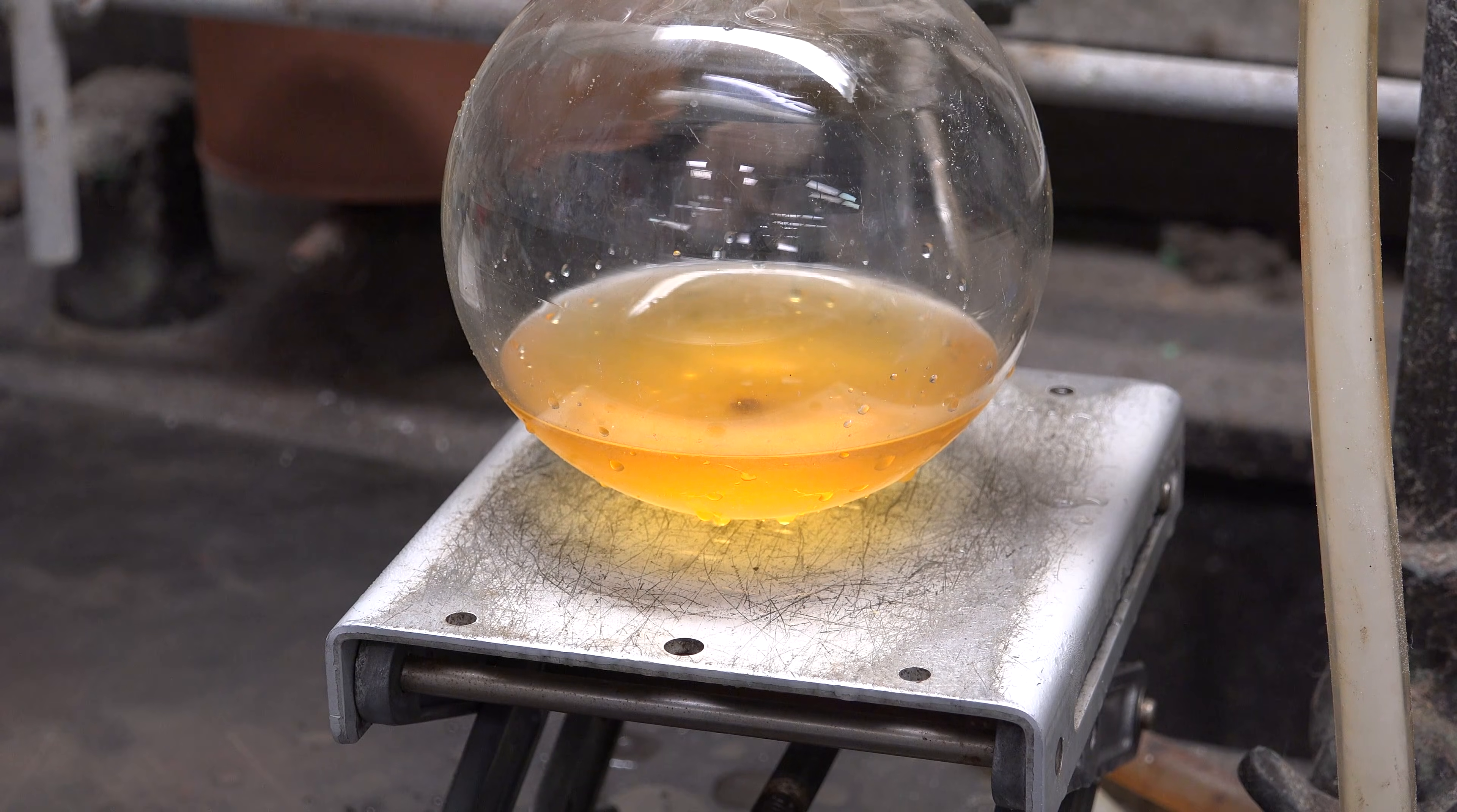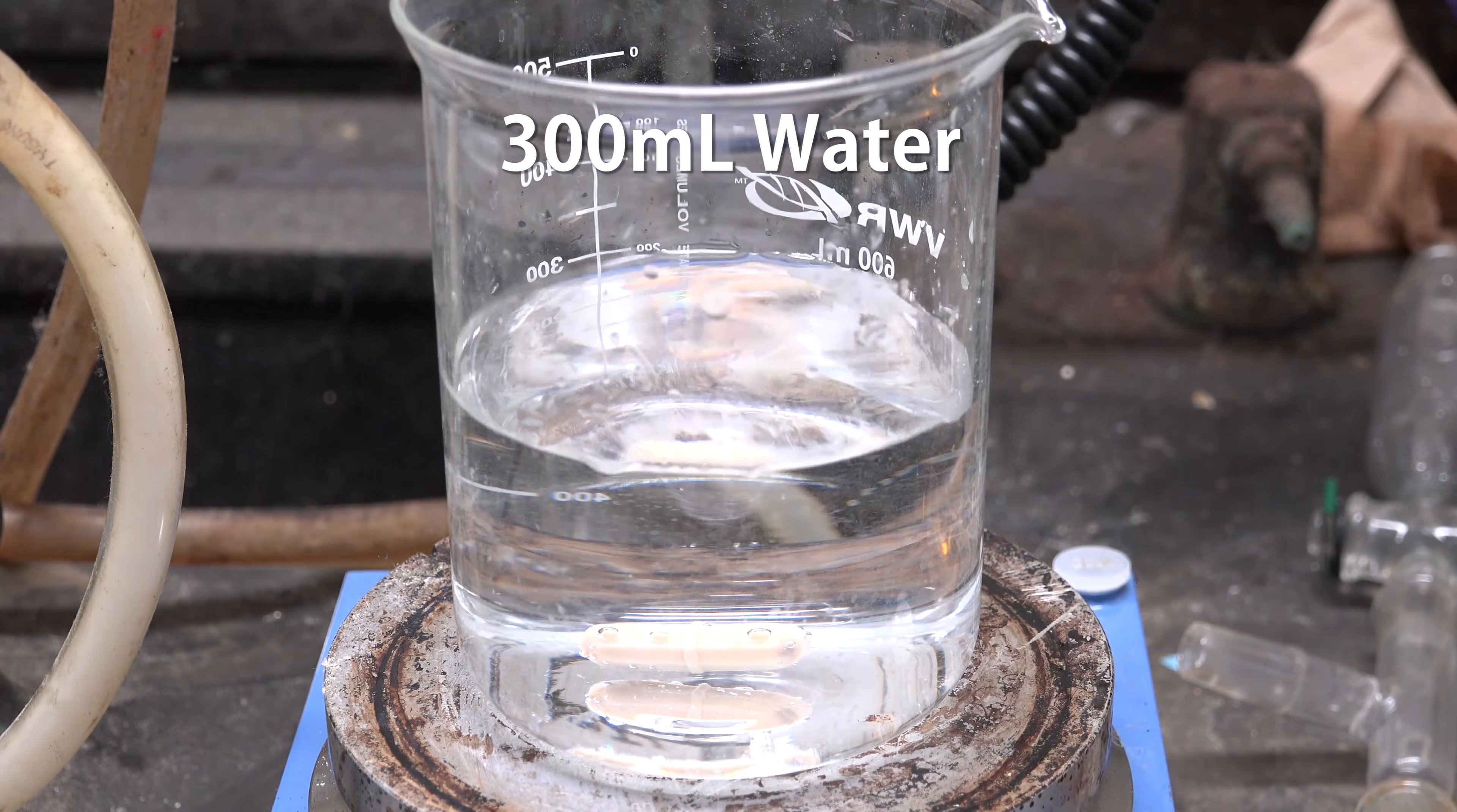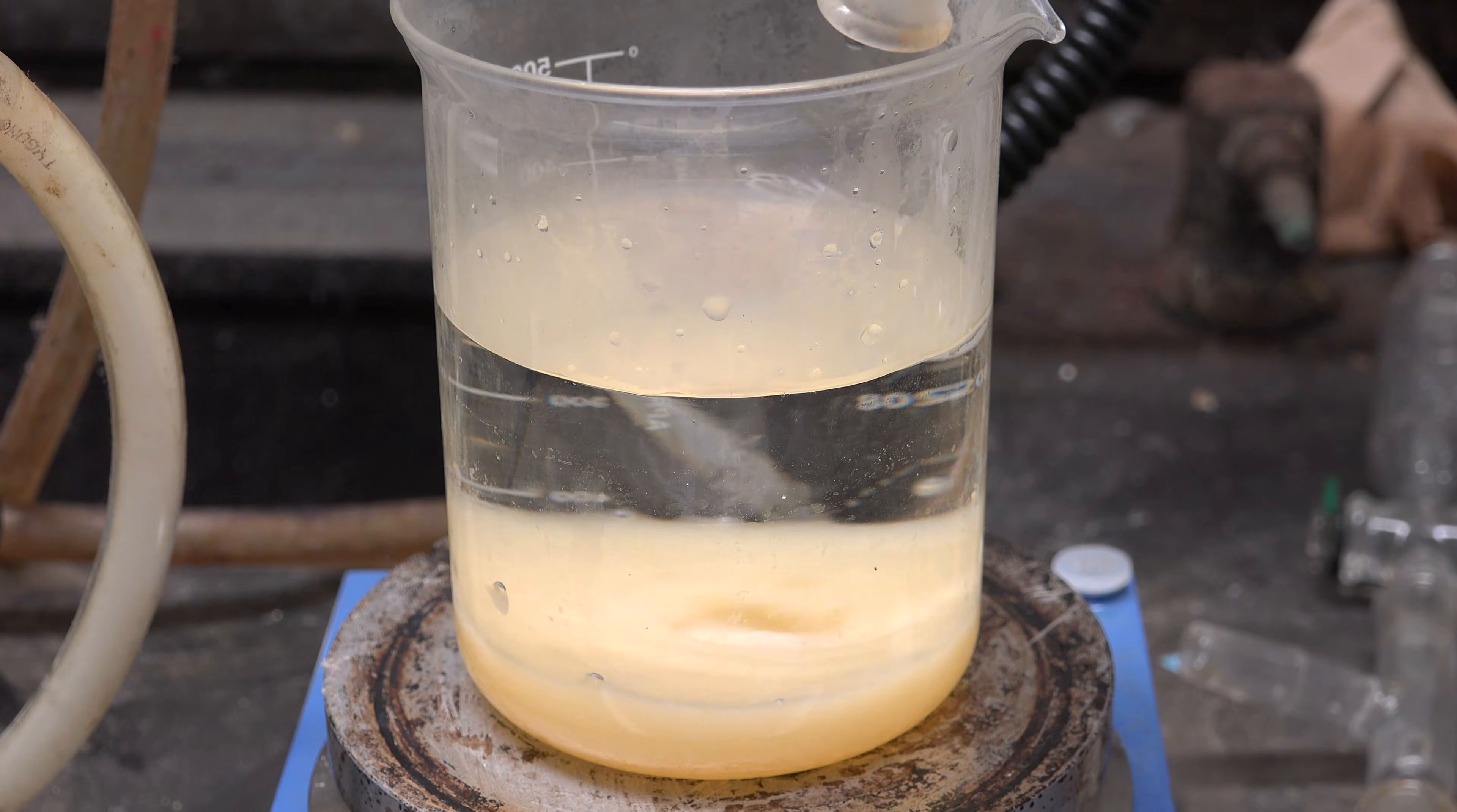And there we have it, crude bromoethane. It should be clear but we have bromine contamination as well. To purify it, we first get about 300 mL of water and directly add our crude bromoethane. Bromoethane is denser than water so it sinks to the bottom.